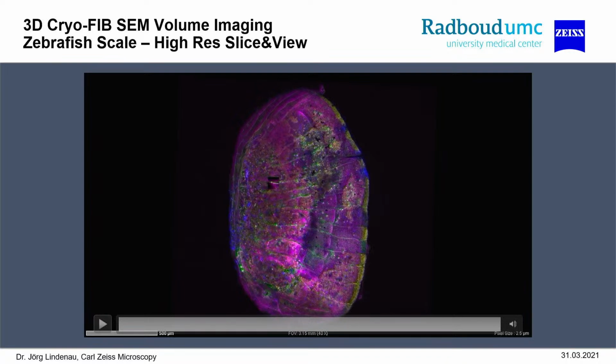Okay. Thank you. And the next one is how deep in that direction can you take slices and view images before you're at the end of the beam shift? I don't know. I would have to ask my technicians to answer this. So I'm sorry. But obviously, you're asking when do I have to reset the beam shift? Right. But we did it successfully with C. elegans for 80 microns. So, but resetting and finding the same position again. 18 microns? 80. Oh, 80 microns. Yeah.